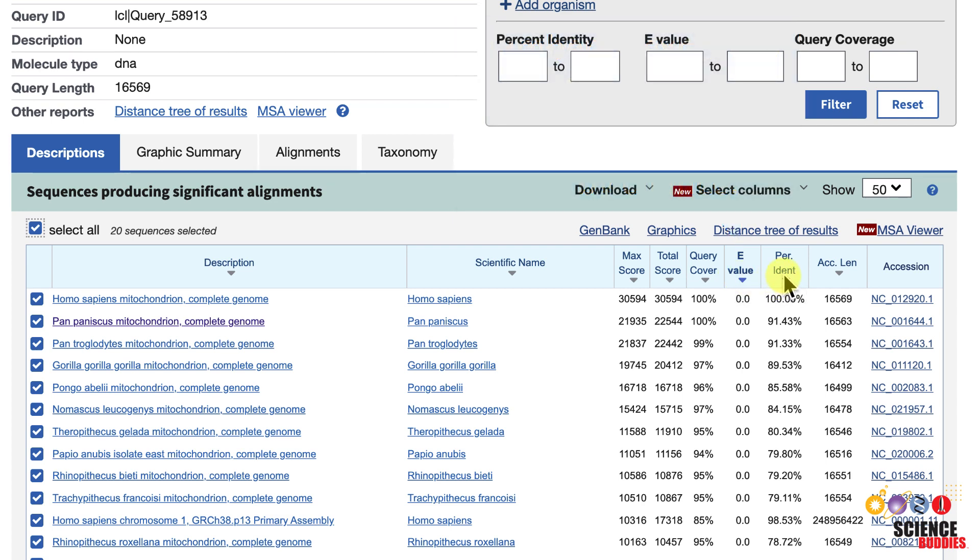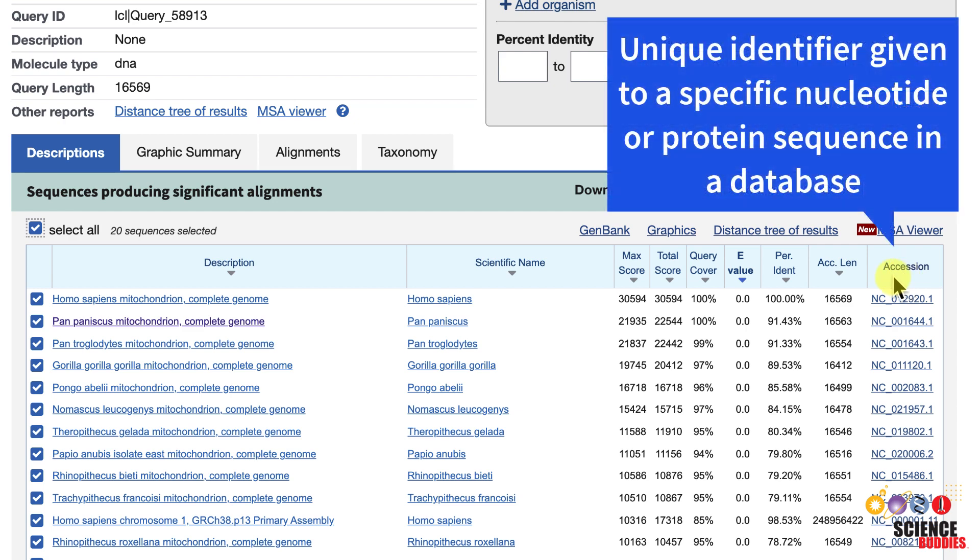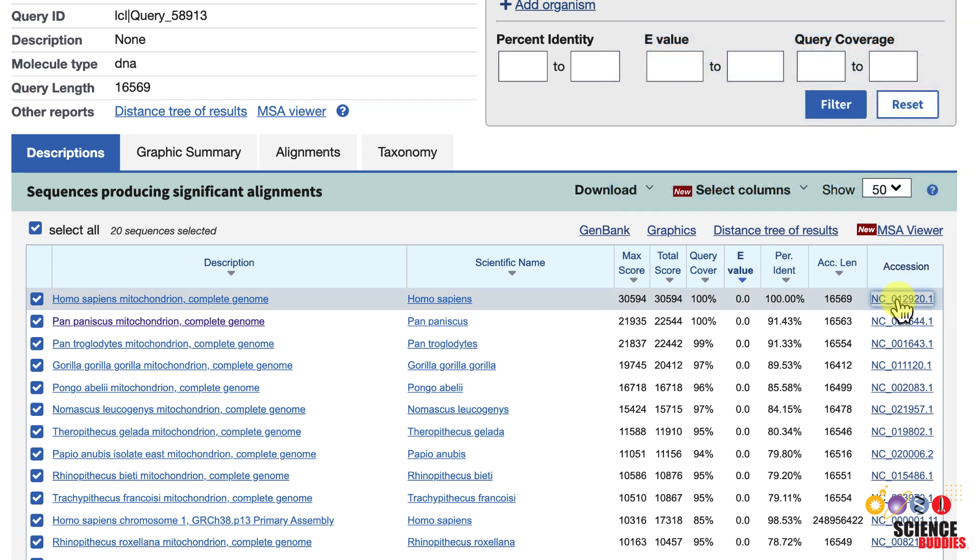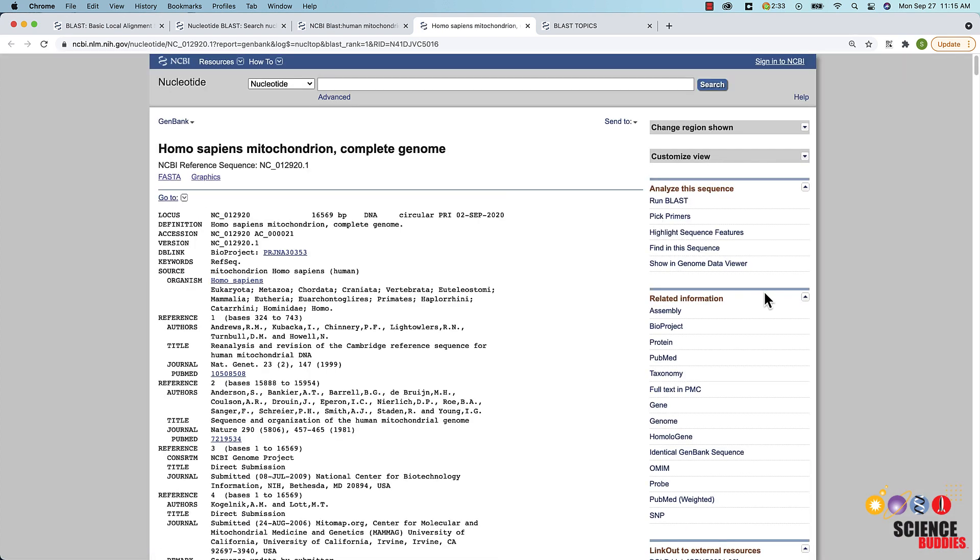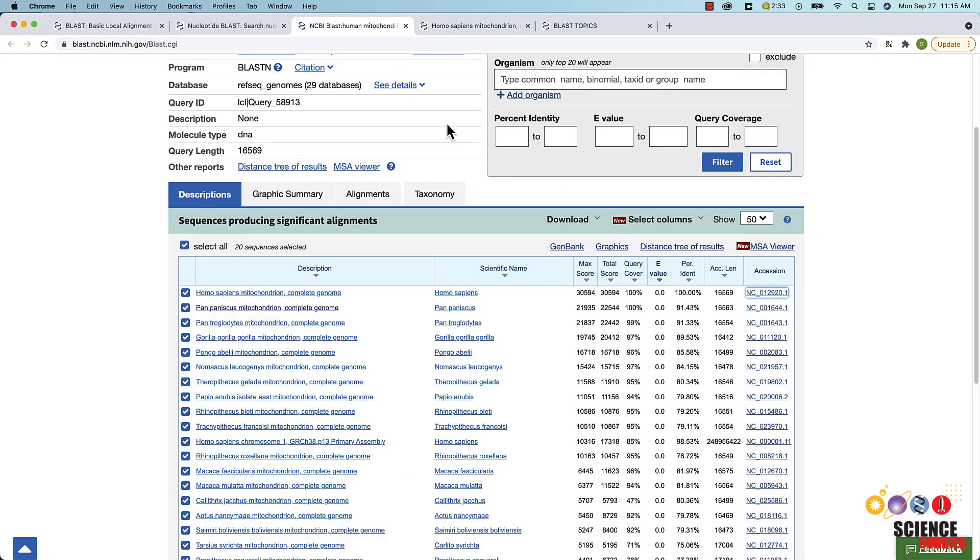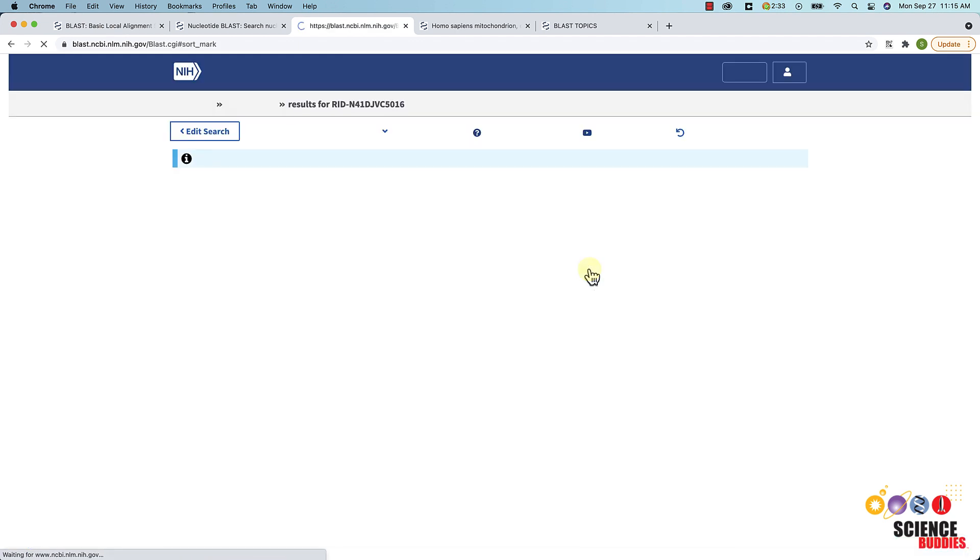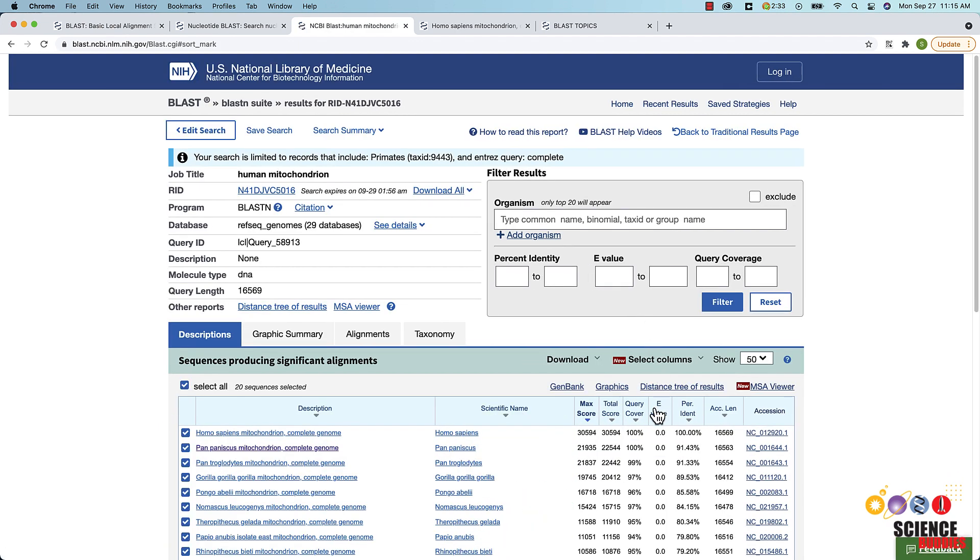You will also find the maximum identity or the highest percent identity of the database sequence and the accession number of the database sequence. The accession number is a unique identifier given to a specific nucleotide or protein sequence in a database. Clicking on the accession number for one of your matched sequences brings you to the GenBank record of that sequence. Clicking the column header changes the default column used for sorting the table. The default sorting is by e-value.